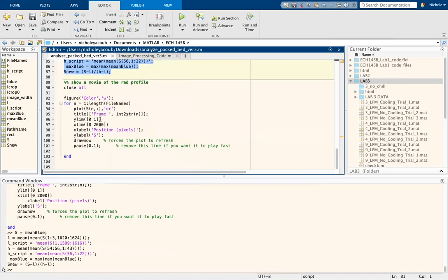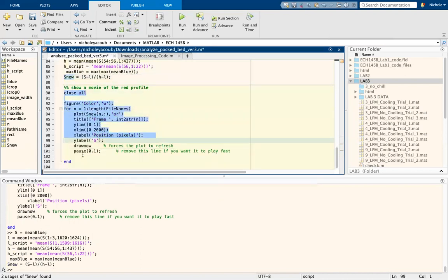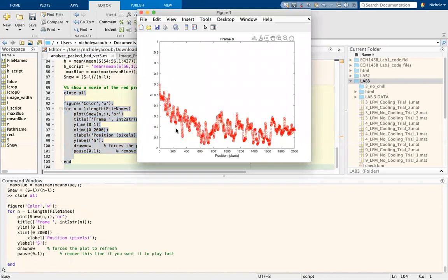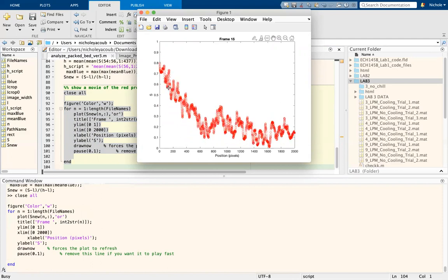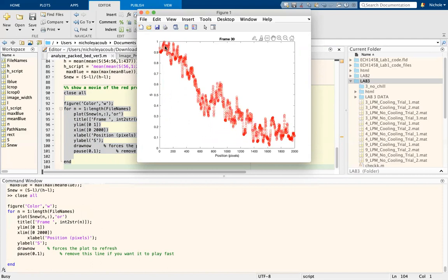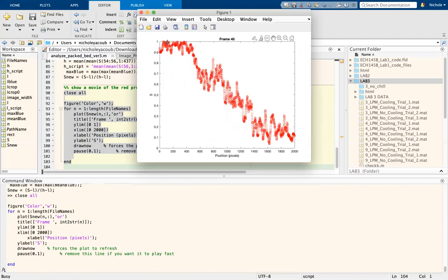When I run this and then change this to SNew to match my new designation, and rerun, we'll see that we're actually starting at 0 and we're going closer to 1. You'll see once it progresses further. See, we're already past 0.8, and we're already past 0.9. We're hitting 1s. Looks good. And we hit 1 in this entire region.